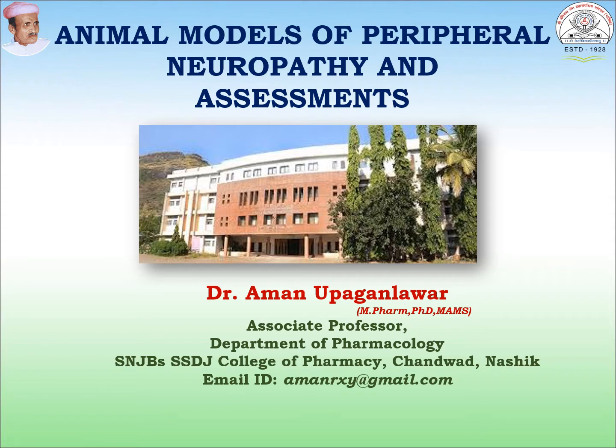Friends, today we are going to discuss various animal models for peripheral neuropathy and its assessment. As you know, the International Association for the Study of Pain defines pain as an unpleasant sensory and emotional experience associated with actual or potential tissue damage or described in terms of such damage.